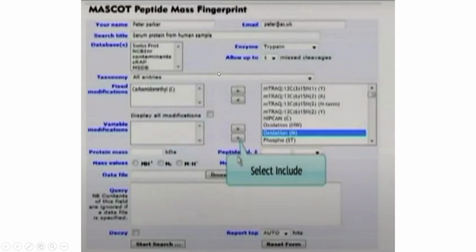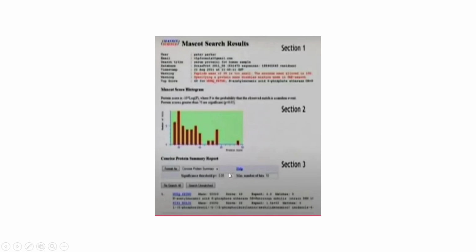So all those details you need to give first, and once you give it, then this is how the analysis will give you. If there is an error, it will be red in color, and if you are not given certain details properly, then it will tell you to add those details. Then this is how the certain proteins or certain peptides which are present, you can accordingly check those specific proteins, and the peptide sequence is also given accordingly.